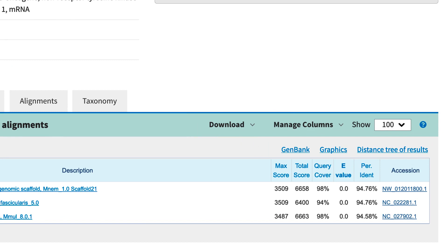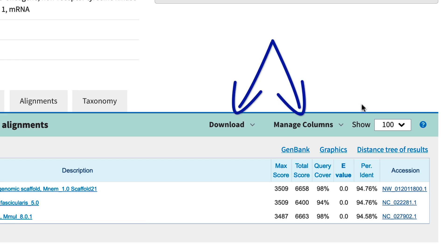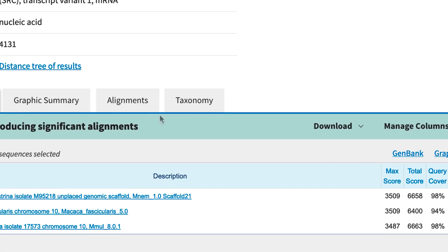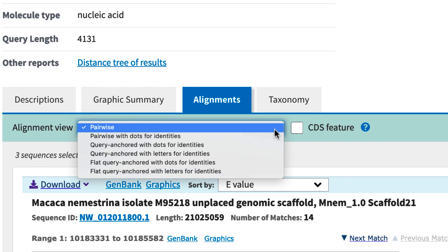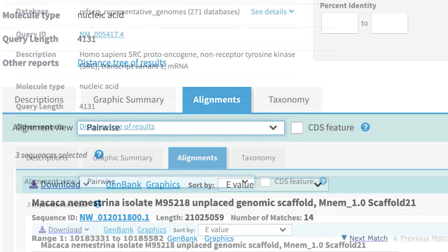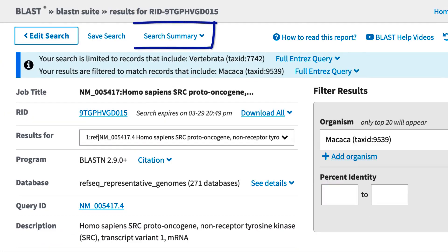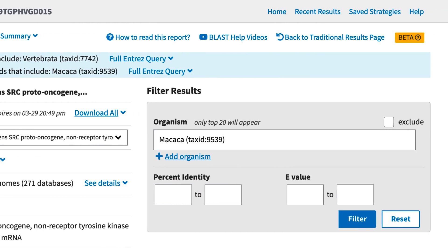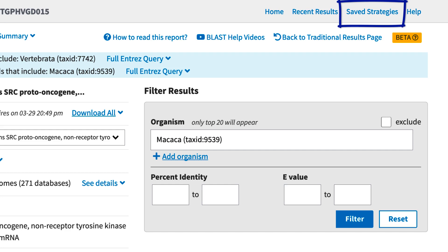Now I'll point out other parts of the report that are in a different position on the page. Download and Manage Columns are here. The Show menu has moved out of the Formatting Options menu, as have Alignment View and the CDS Feature checkbox. Search Summary is up here at the top of the page. The Edit and Submit link is now this Edit Search button. And Saved Strategies, which can help in the reproducibility of your searches, remains here at the top right.